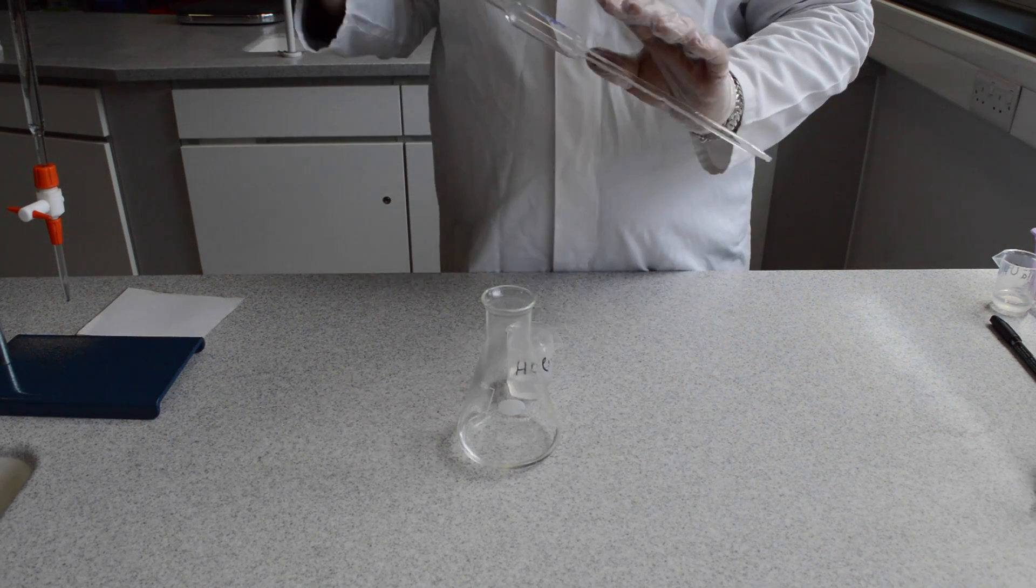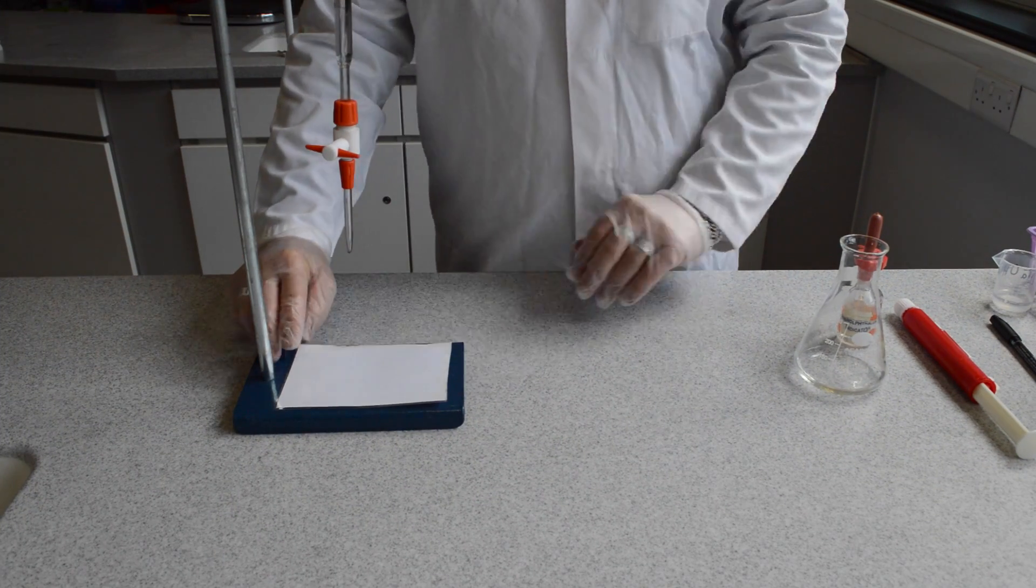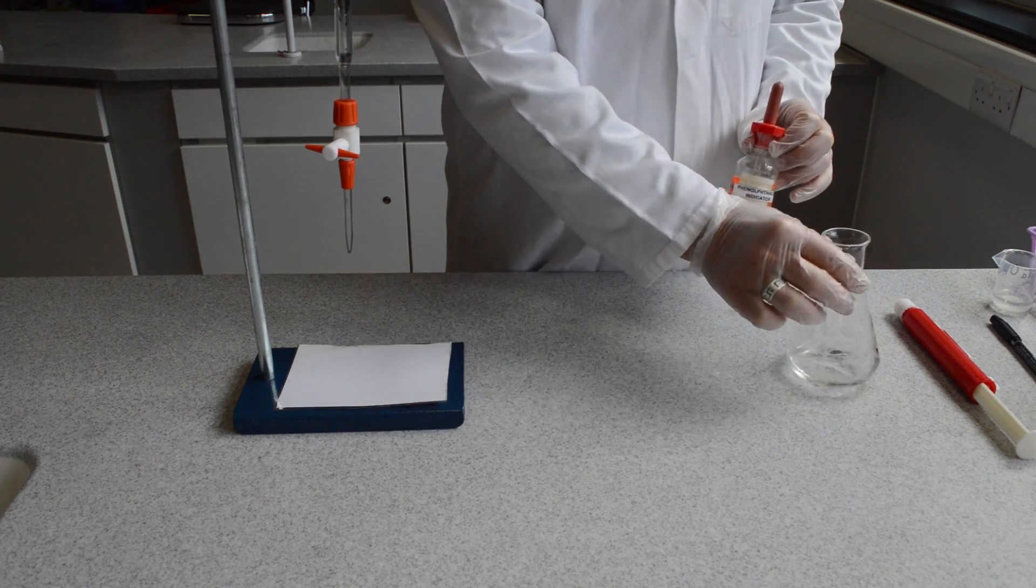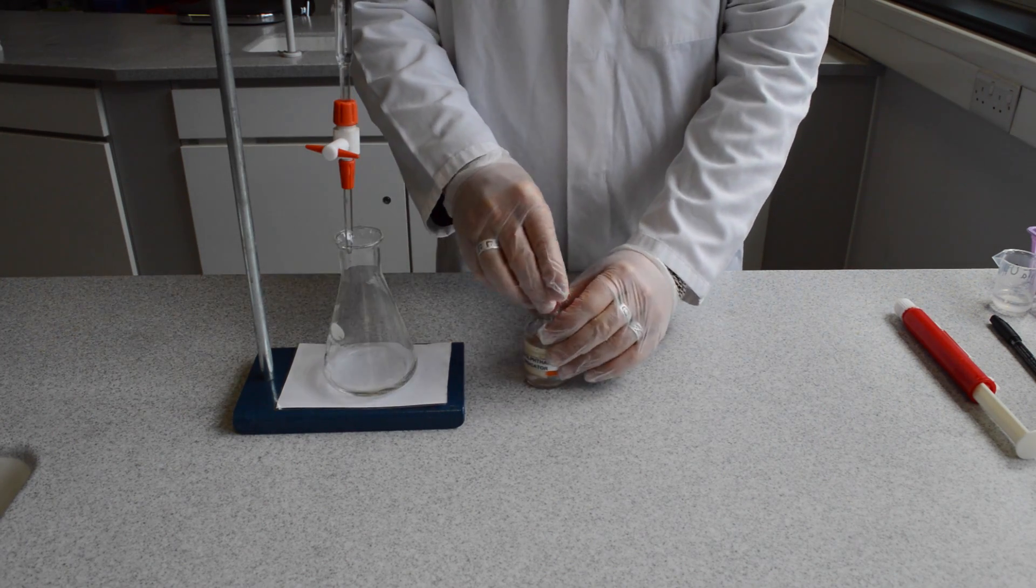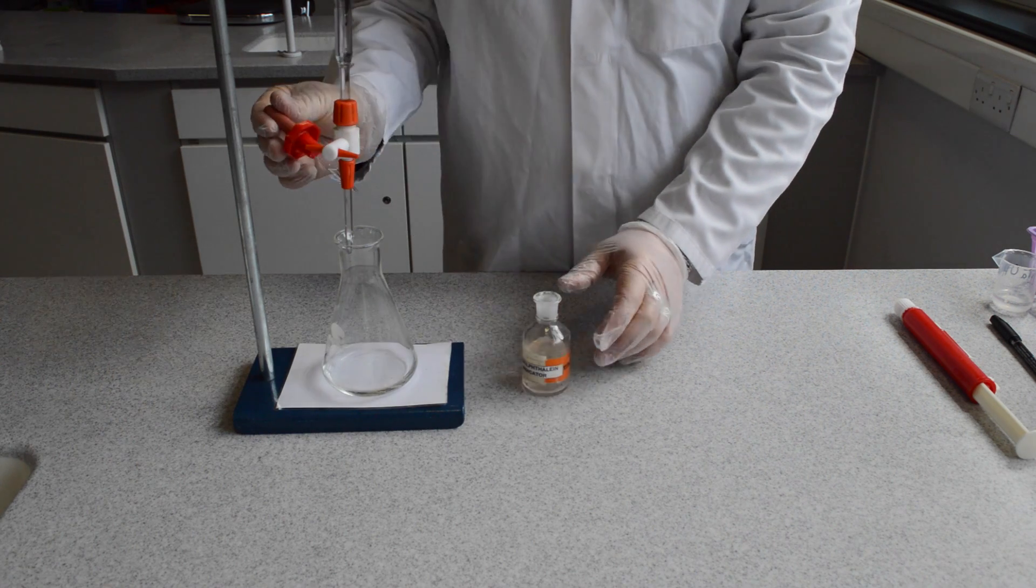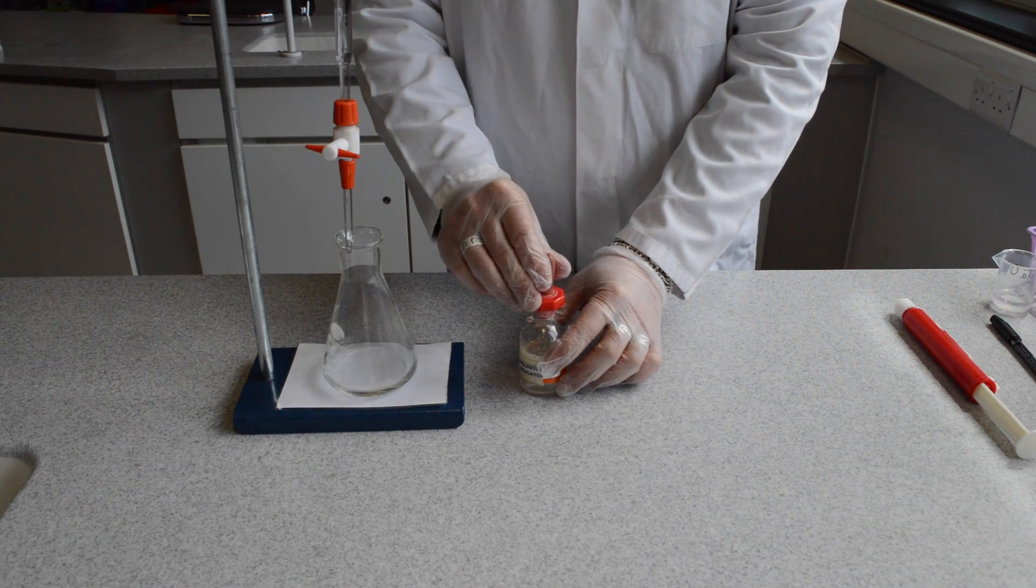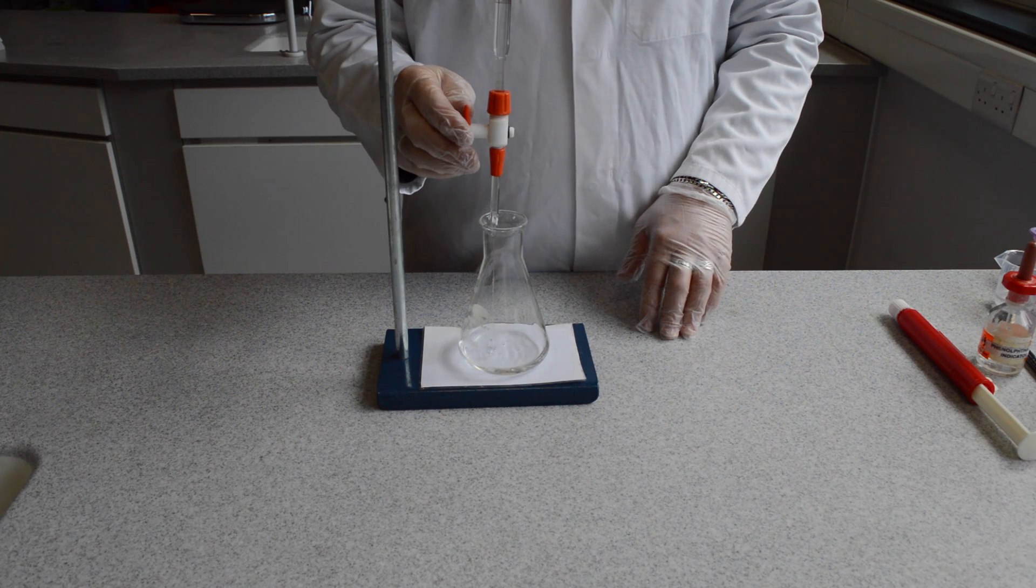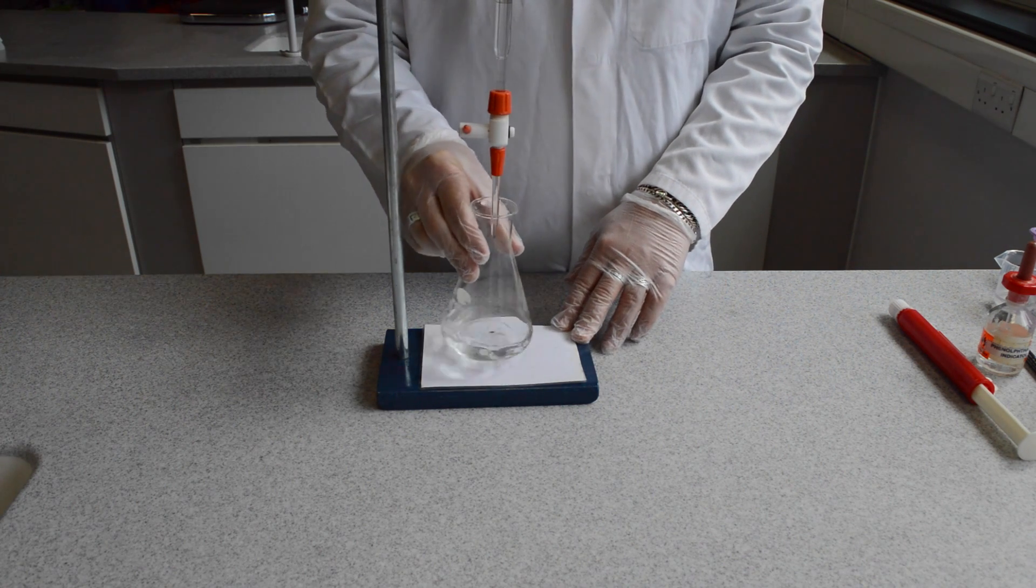When performing the titration, use a white card or white tile on the base of the burette stand. This enables any colour changes to be easily visible. Add two drops of phenolphthalein indicator to the hydrochloric acid in the conical flask. Then start to release the sodium hydroxide from the burette into the acid in the conical flask.